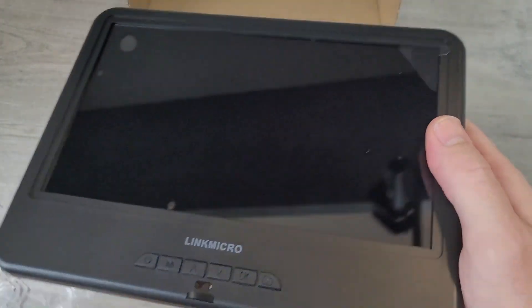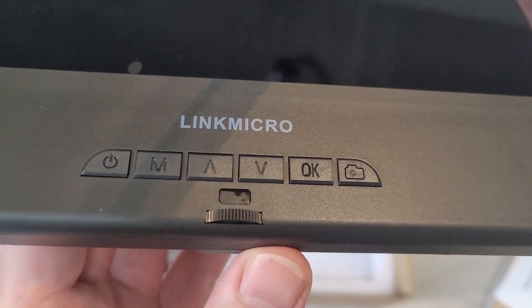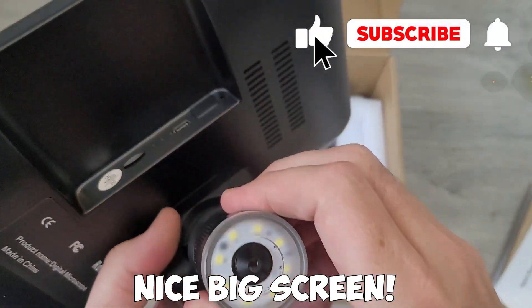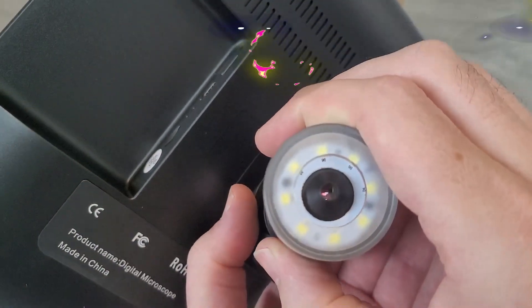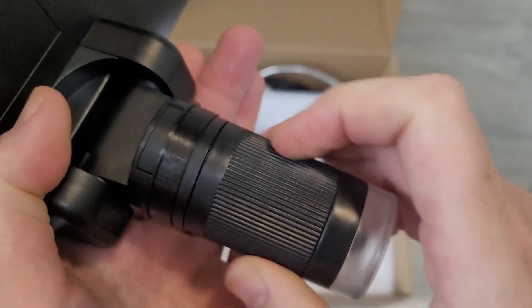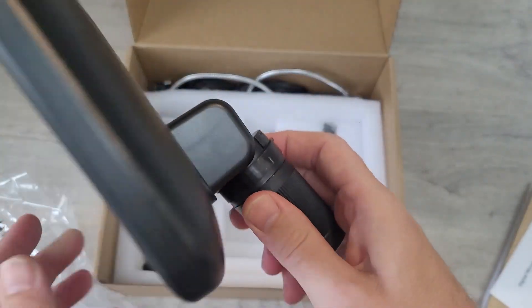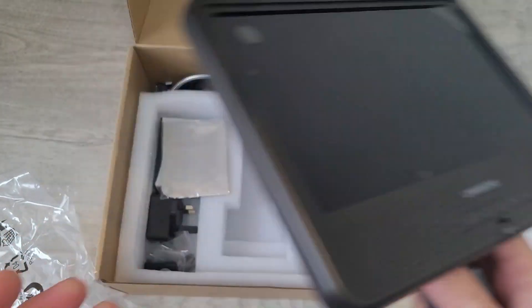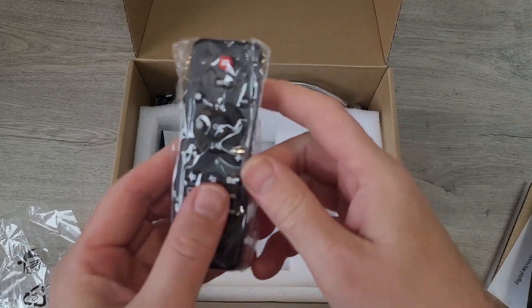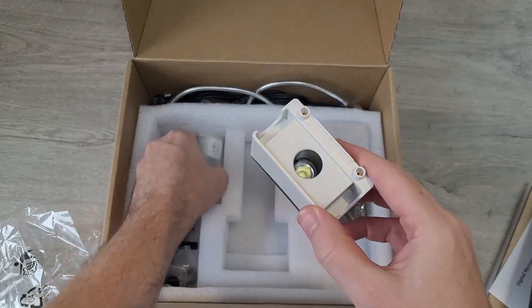Quick look in the box: there's the big 10.1 inch screen, a few function buttons on the front, and a nice little dial. It records in 1080p as well as lower resolutions. There's also a nice remote control included.